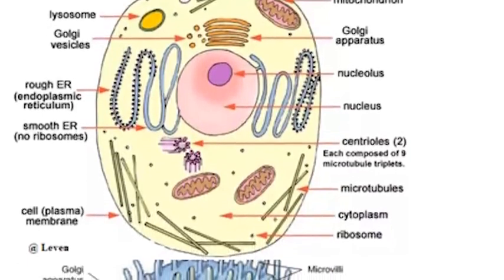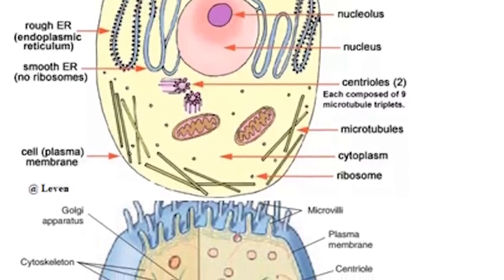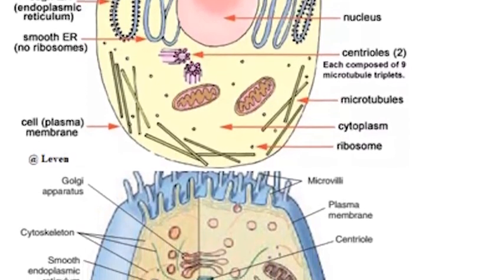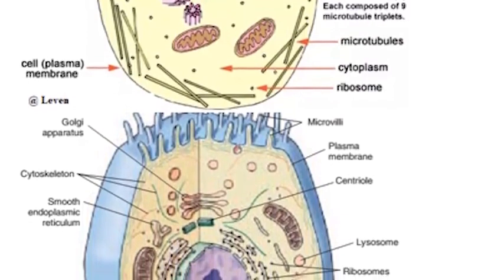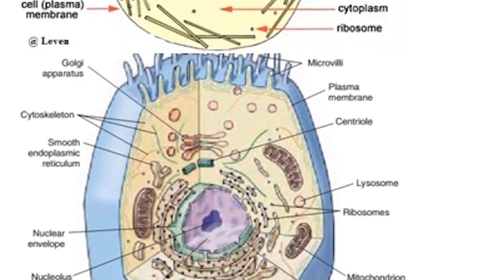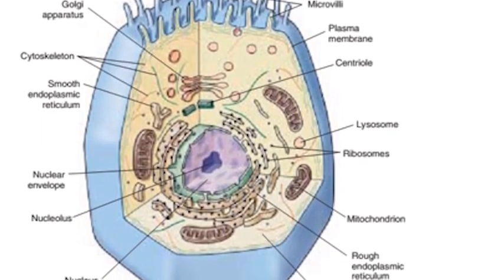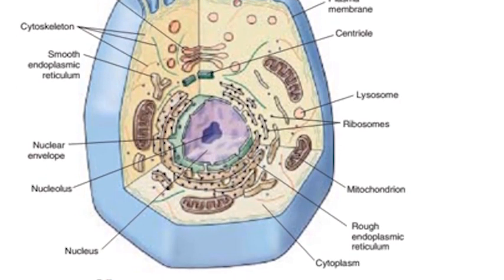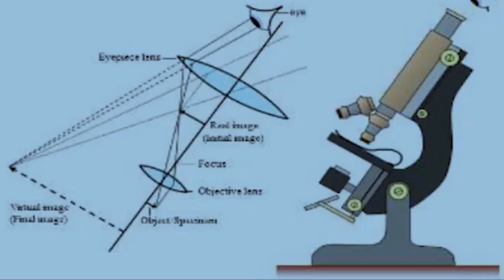They all need to survive. Their vital activities allowing them to survive take place within the cells. The question is, do you think you can see the cell by your naked eyes? The cells are too small to be seen by naked eyes. So to overcome this problem, some scientists have developed the magnifying instruments such as hand lens and microscope.